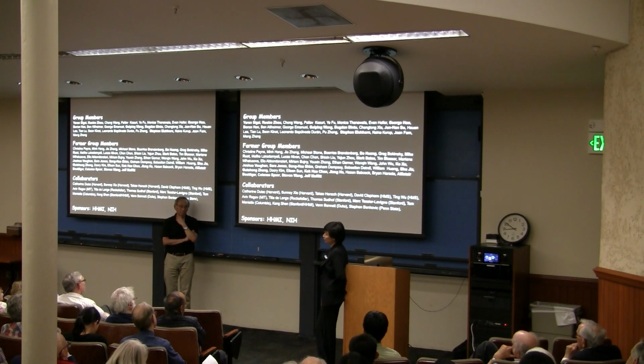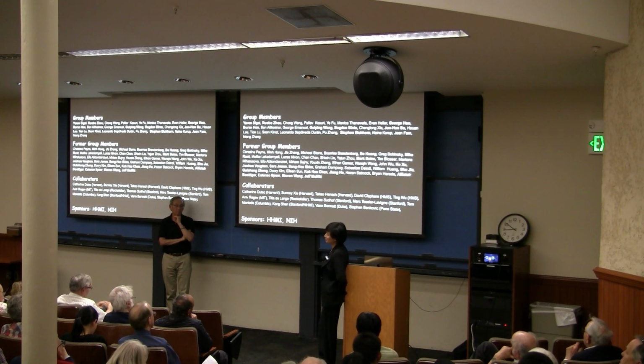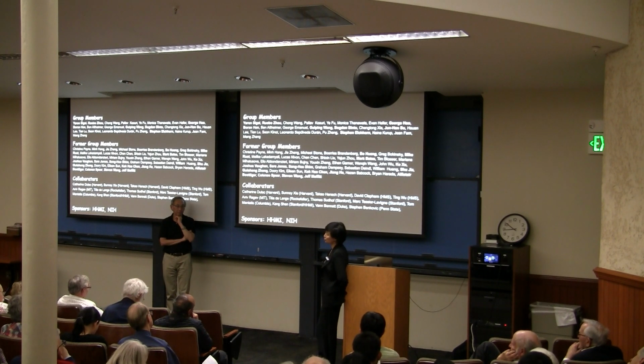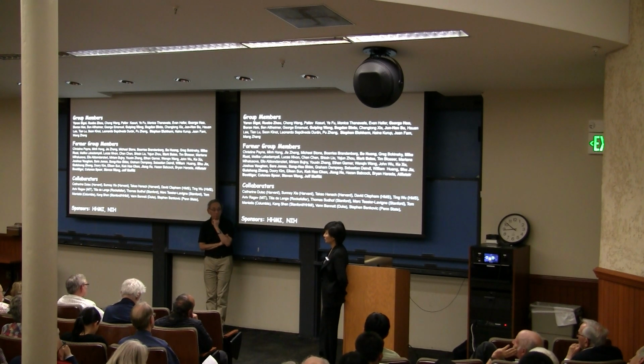For example, in the second part where we do fluorescence in situ hybridization, those are cells that are already fixed in the first place. And then also for the protein imaging, some of the earlier parts that I talked about, there are two kinds of generally used labeling approaches. One is more geared towards fixed cell imaging. The other is more geared towards live cell imaging.